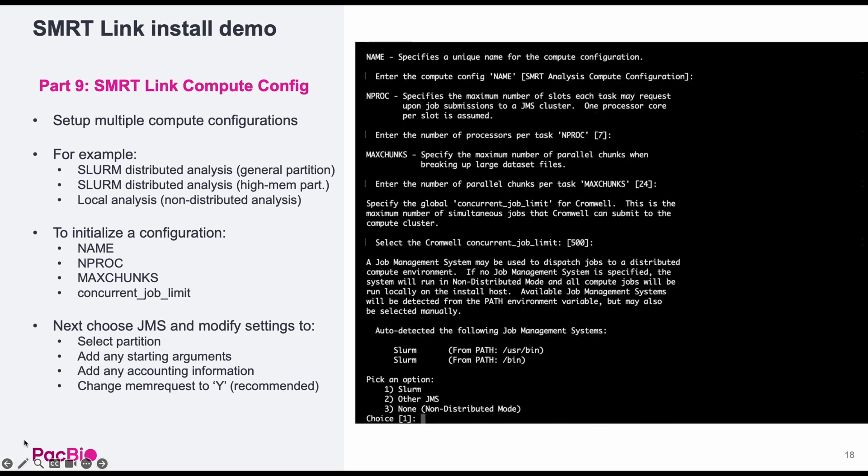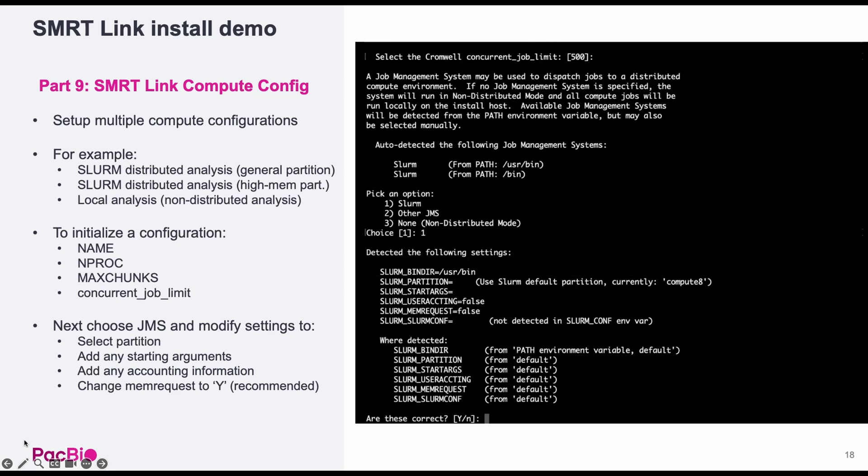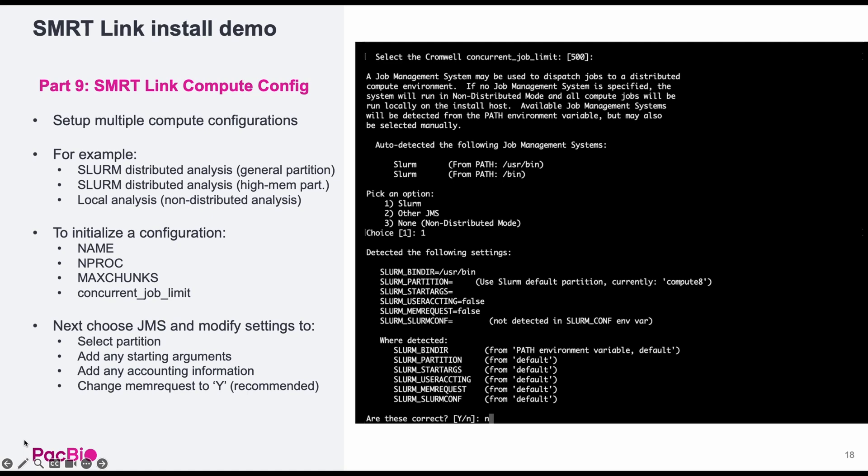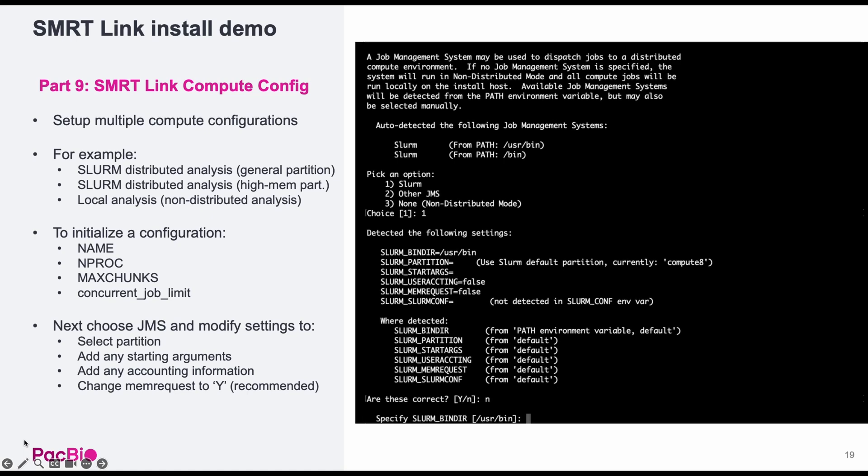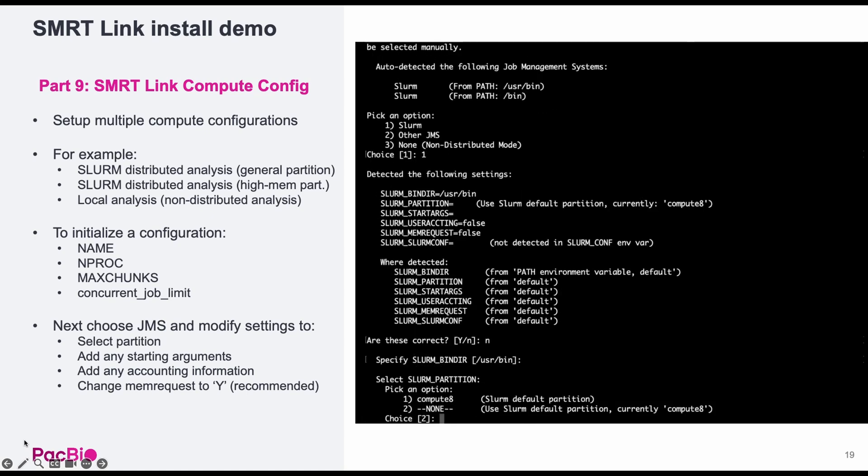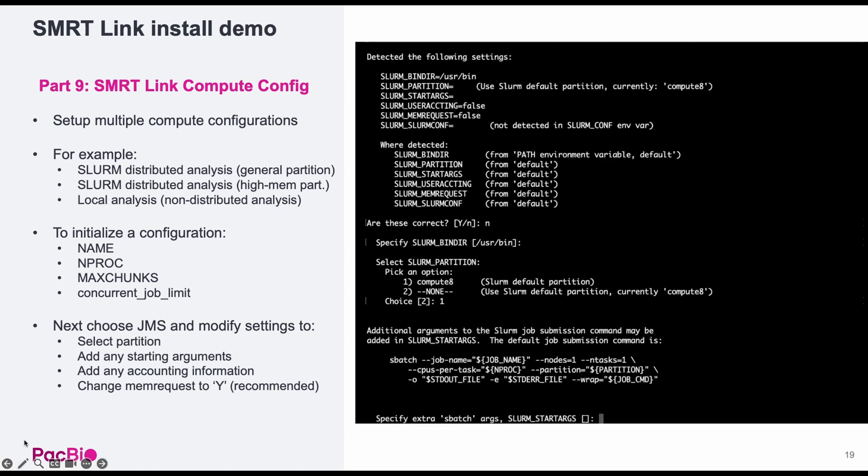Next is choosing a job management system or JMS such as SLURM, PBS, or LSF. The installer should recognize which you have available on your system and present you with that option. I will be using SLURM. The installer will detect several default settings for your JMS. I recommend choosing no here to modify these settings and go through the settings individually, particularly to change the memory request settings.